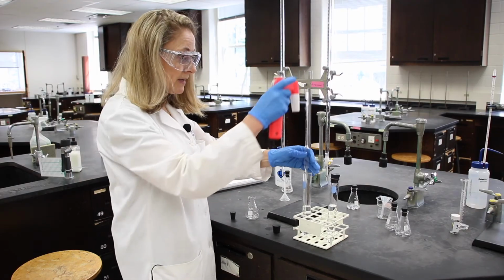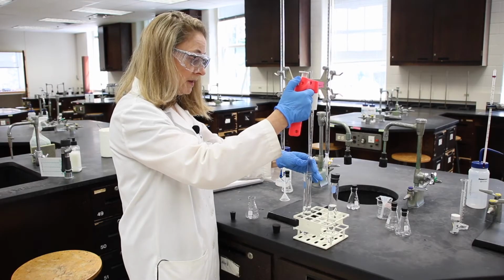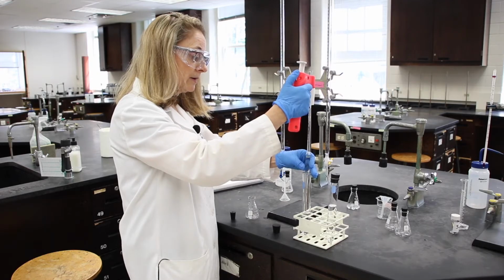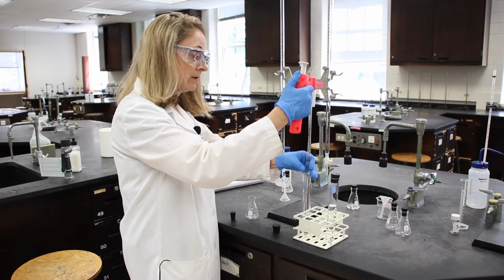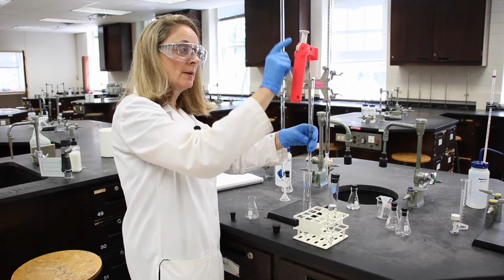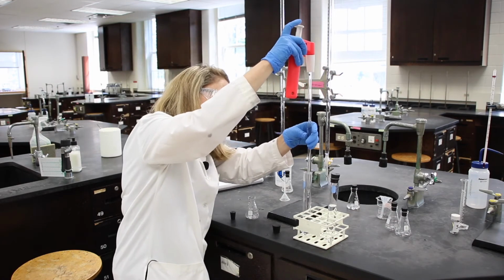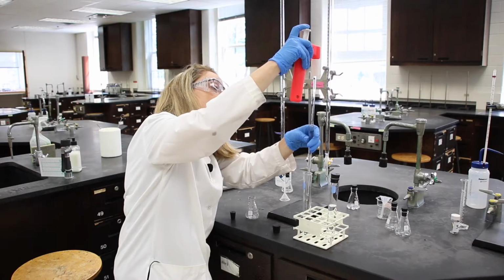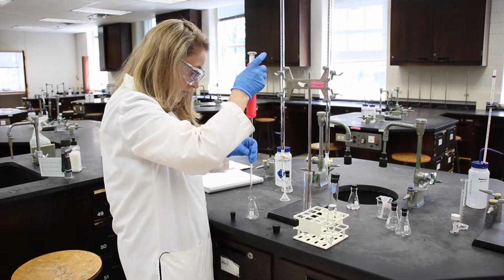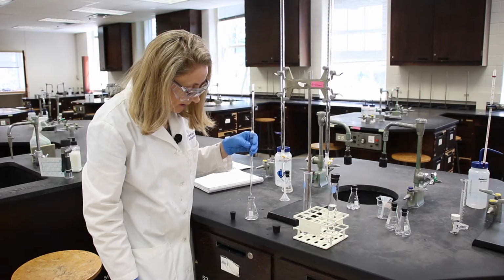And then I will draw up my sample. Again, I'll go over the mark, lift my pipette out, and then either use the top or the side wheel or the lever, my favorite is the top, to get the meniscus on. And there we go. And deliver that to my flask.